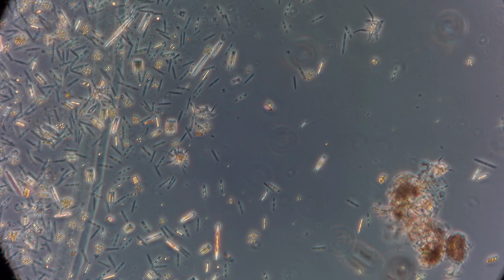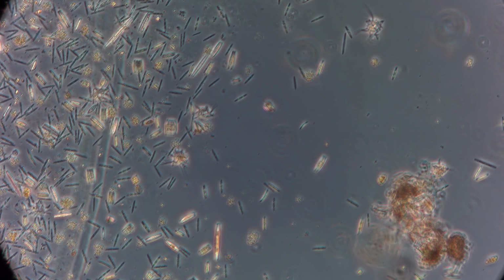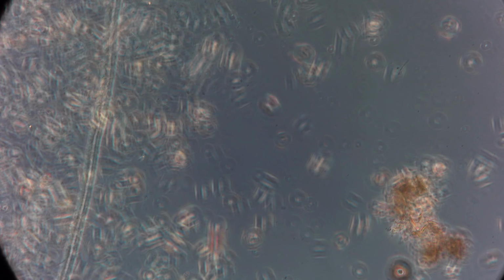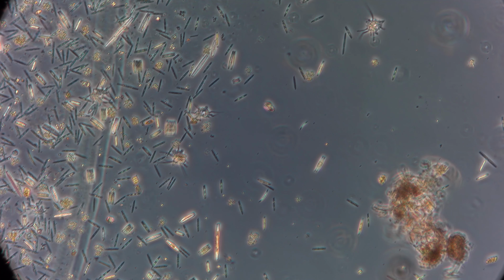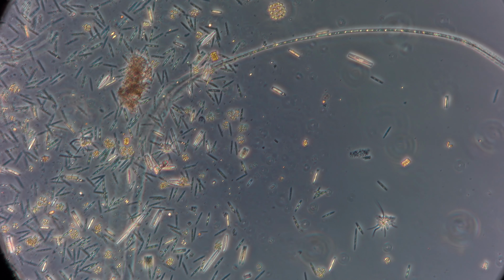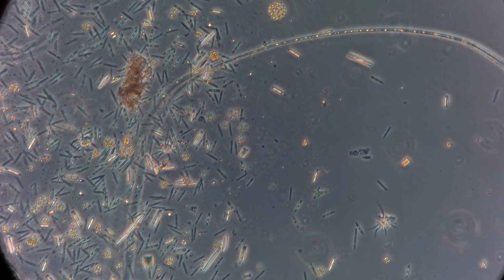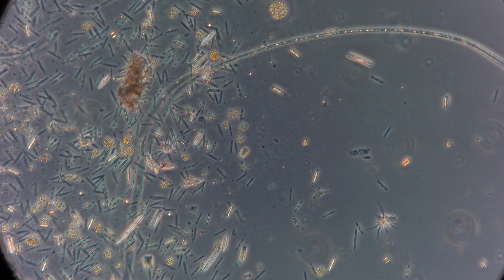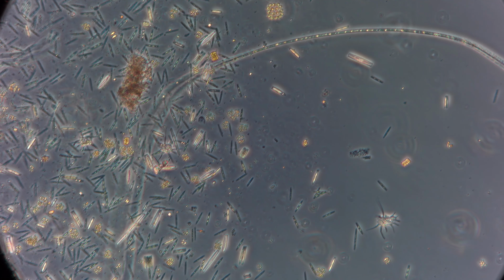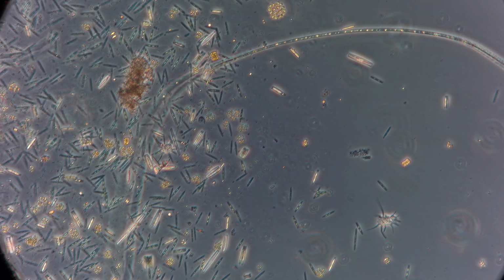That's cool. I think here comes our friend, the triangular swimming algae. I love it. Moving along. So the time lapse, it's not a very active one. If you wait long enough, this guy's moving. You can actually kind of create something. Depends how active it is. It's not very active.